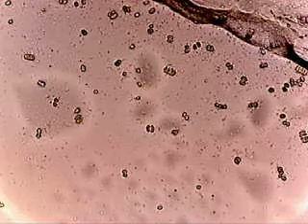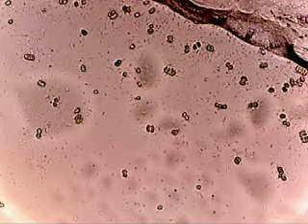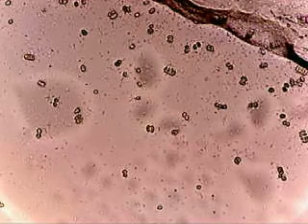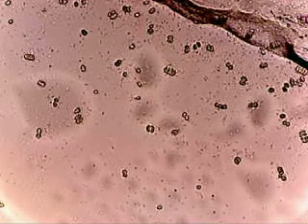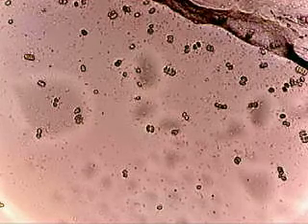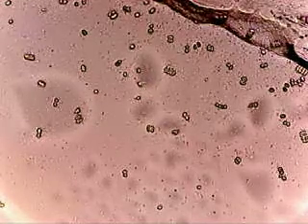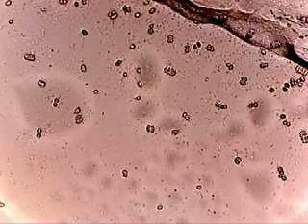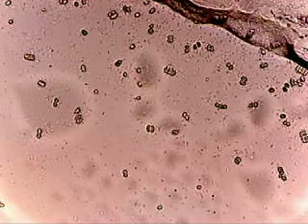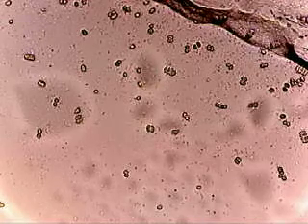What was interesting, though, is the explosive growth rate of miscellaneous bacteria. It was really shocking, and I do not have any explanation for this. Maybe they're feeding off the alcohol that the yeast produced a little bit. Who knows? Anyway, that's not the point. The point is this particular field of cyanobacteria, the blue-green algae, the large ones that you see there that are slightly greenish to the eye.